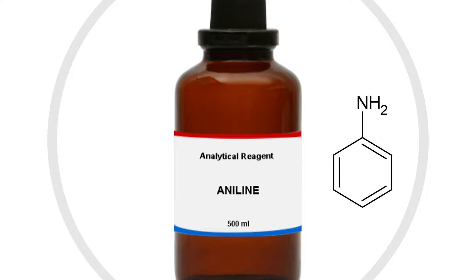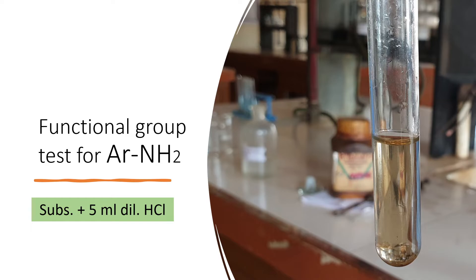For testing I am taking aniline. The structure of aniline is shown — as you can see it contains the functional group NH₂, meaning it is a primary amine. We take the substance to be tested in a dry test tube. I have taken aniline and added around 5 ml of HCl. The substance dissolves in HCl as it is basic in nature.